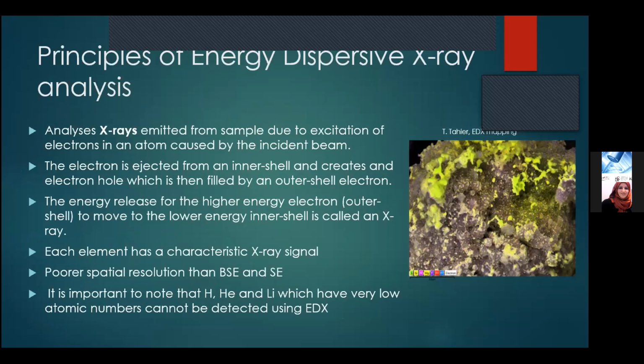So the principles of energy dispersive X-ray analysis. So these are the X-ray signals that I was talking about earlier. On your right, I've added an image. It's called an EDX map. This helps with the identification of various types of elements and also separating them and making sure that you can actually establish and distinguish between the elements. And this is a color overlay, so you can choose the various types of colors and change it up and make it a very interesting picture for an article and so on.